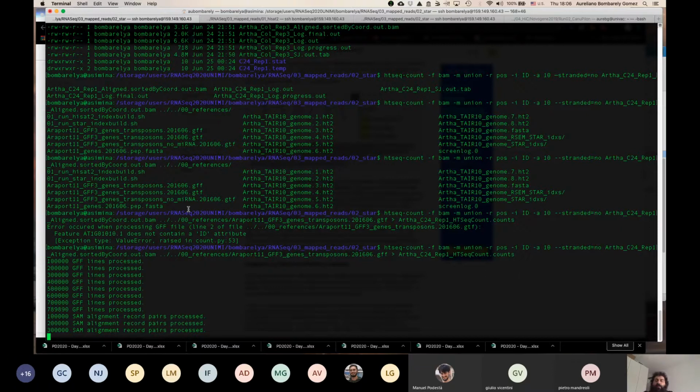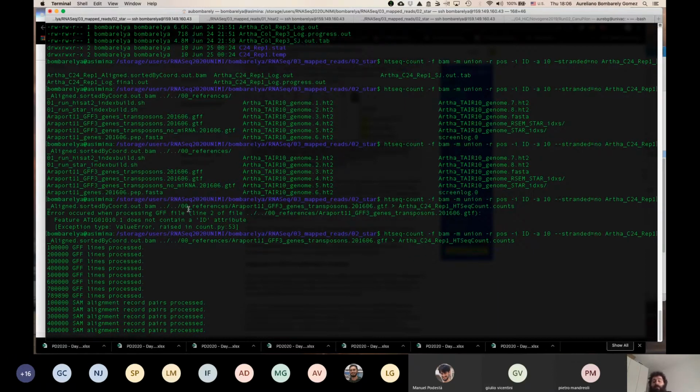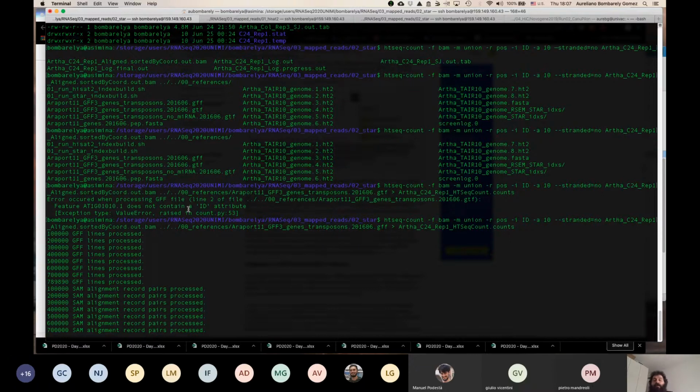As I said, in both cases, StringTie and HTSeq count, this quantification by itself doesn't have any meaning because it has not been normalized, it has not been tested and put in a way that is easy to work with. So it will be in the next step, when you do the differential expression, and produce a file where you can look for the expression of the gene.